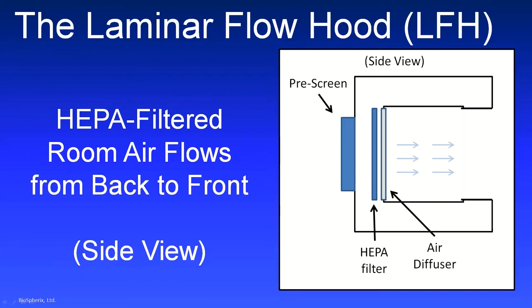It's opening out to the room to the right, and the back of the system is to the left. There's a fan in the back that blows room air across the work surface after having been passed through a HEPA filter. This space is not designed for open processing, unlike a room air BSC, although it looks kind of like a BSC. It's really designed to be a safe space to disinfect items and leave them to dry before they come into the system, and to protect the doors of the system from room air so that only HEPA filtered air goes past those doors.